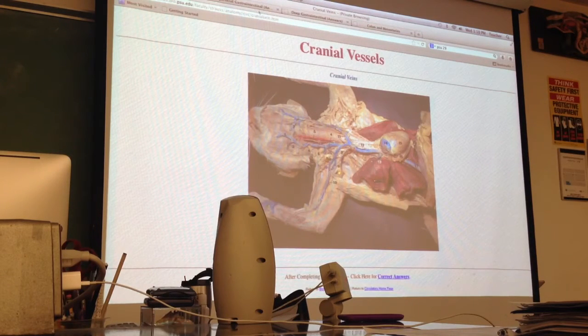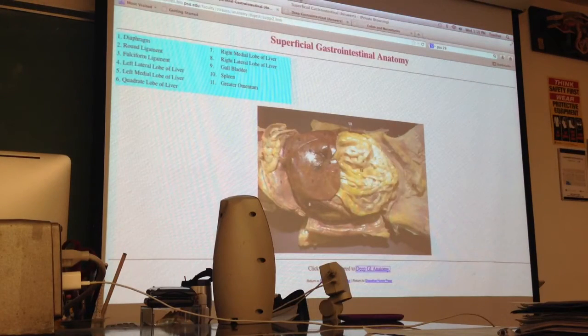All right, now we're going to move on to the abdominal cavity. So just to orient you, here's the diaphragm. So here's the head of the cat. Here's the end of the cat. So we basically just scooted the view over. This is essentially what it would look like when we just opened it up. I'm going to take a moment and use this view to talk about some of the membranes.